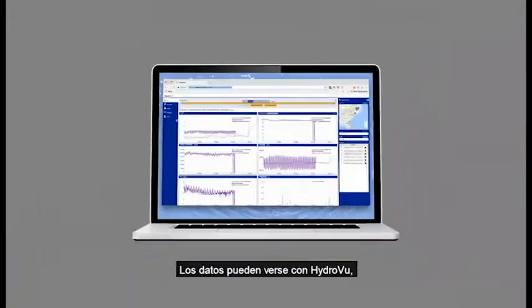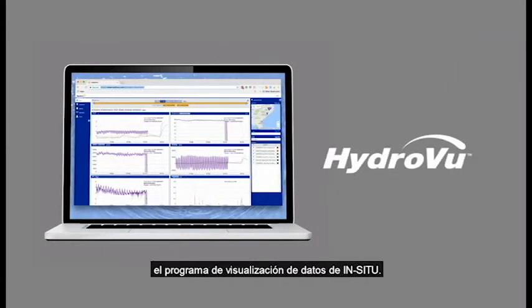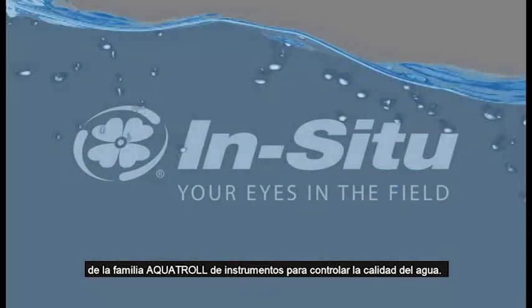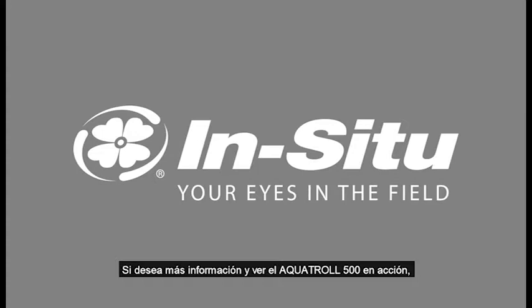View your data with HydroVu, In-Situ's data visualization software. The Aqua TROLL 500 is the newest member of the Aqua TROLL family of water quality instruments. Contact your In-Situ representative for more information and to see the Aqua TROLL 500 in action.